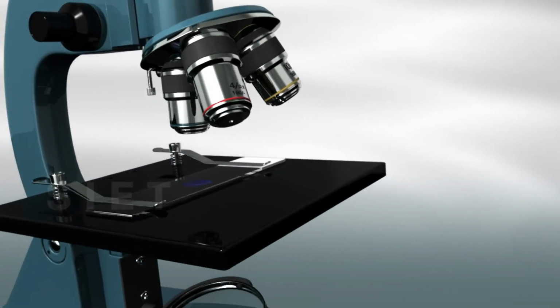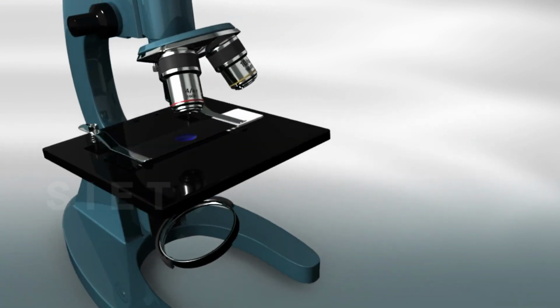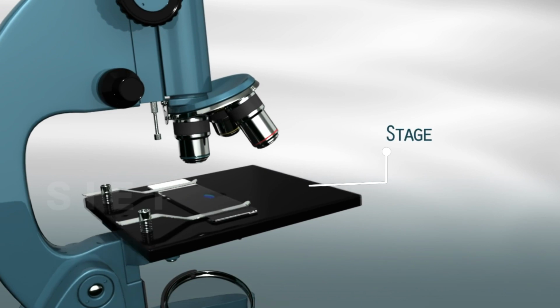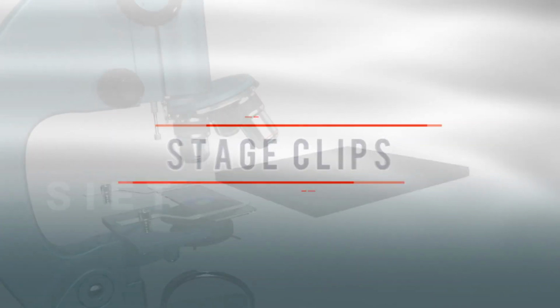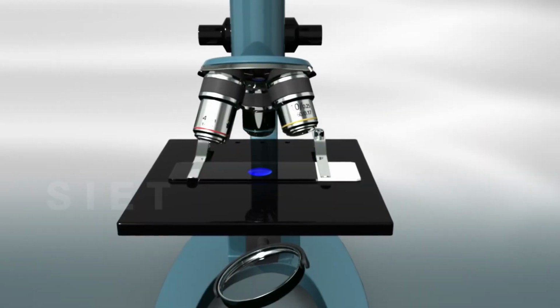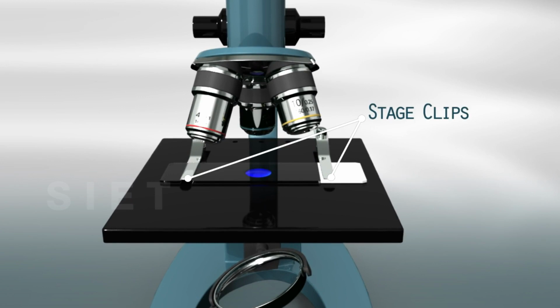The stage. The stage is the flat surface on which you put your slides or samples. Stage clips. This holds the slide in place on the stage.